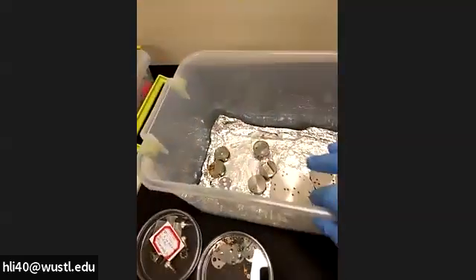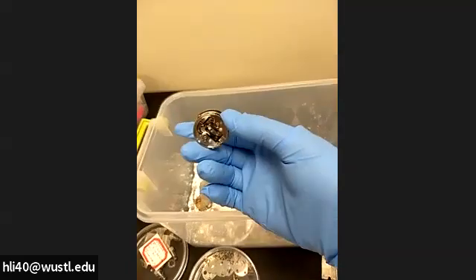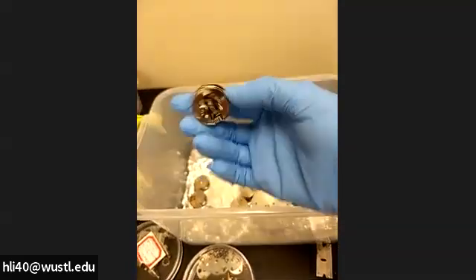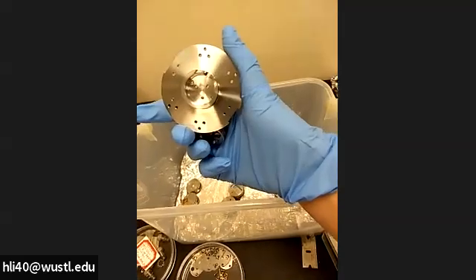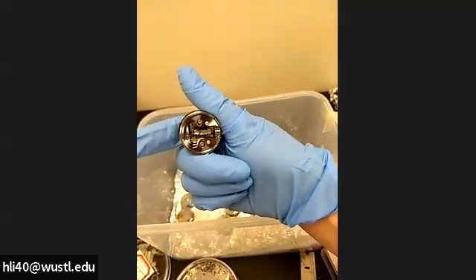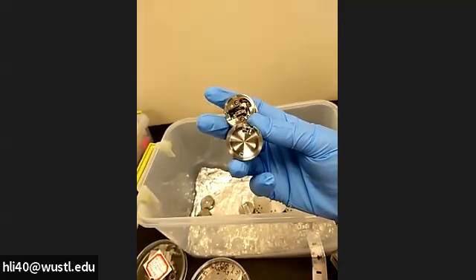If you look at the holder here, we have the 25 millimeter. This is a special one for heating and cooling — you can see the back is complicated. If we look at the 60 millimeter holder, the back is plain. The other standard 25 millimeter also has a plain back — you can see the difference.